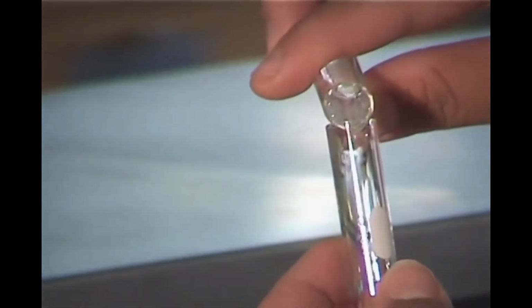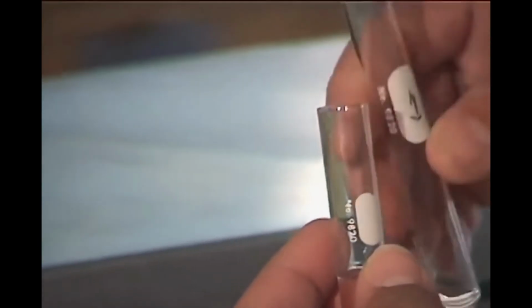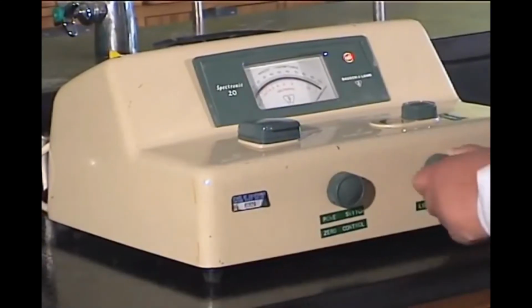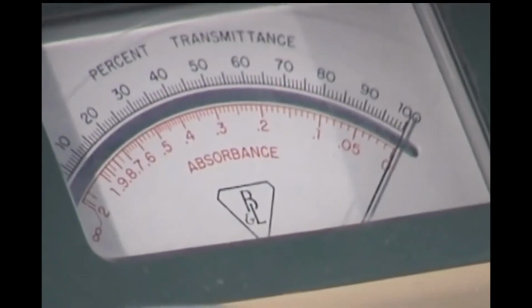First, the blank, or control, that contains all chemicals except the light-absorbing species, is poured into the cuvette, which is then inserted into the sample holder of the instrument. Note that the test tube's label is oriented to the front of the sample holder. We turn the 100% adjust dial so that the needle is set on 0 absorbance, or 100% transmittance.